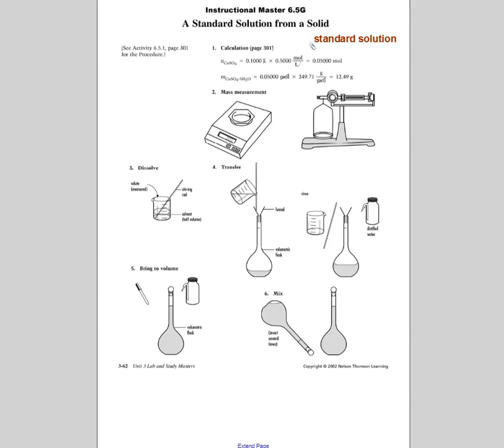Okay, if you're viewing this video, you should have already seen the video lesson on preparing a standard solution from a solid. I'm just going to show a video clip, which I had intended to show previously, but now will be a good review, which overviews this process from calculation to final mixing.